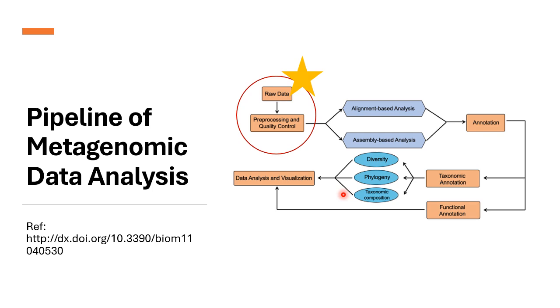Because otherwise, the data may contain very low quality reads or adapters, or very high data complexity, which is going to make the data more complex to analyze, or it can give very low quality results, which is not expected from the analysis. So data cleaning and quality control is really important.